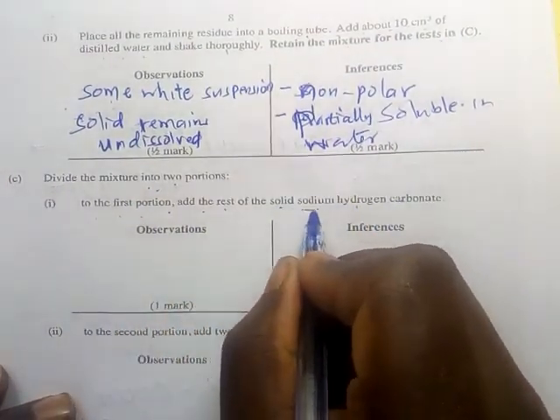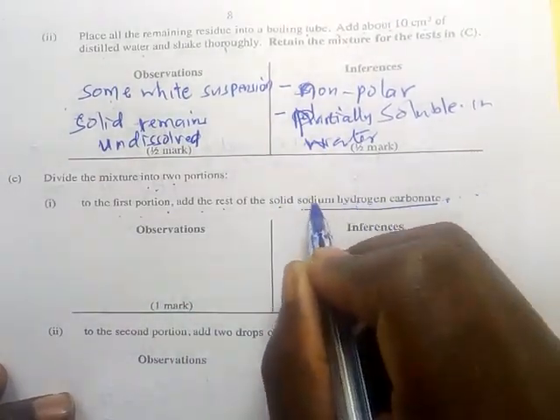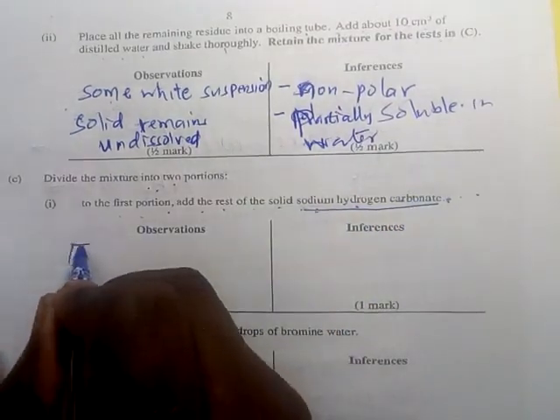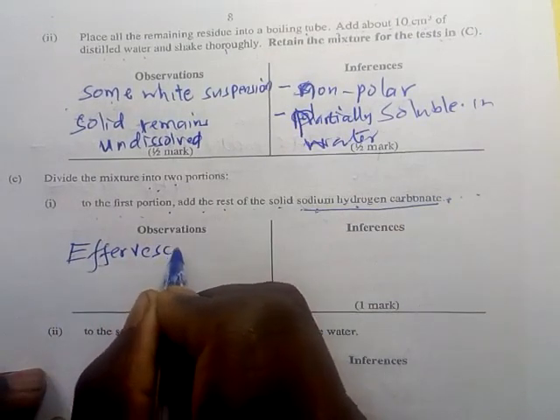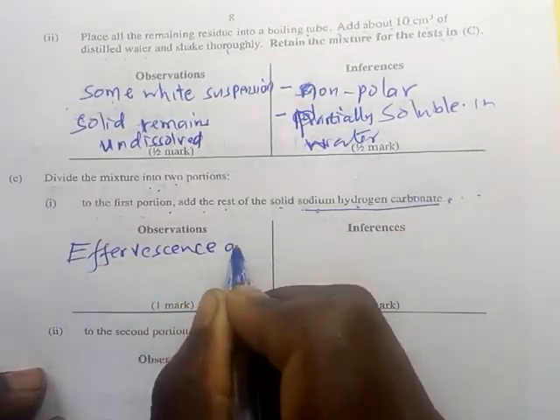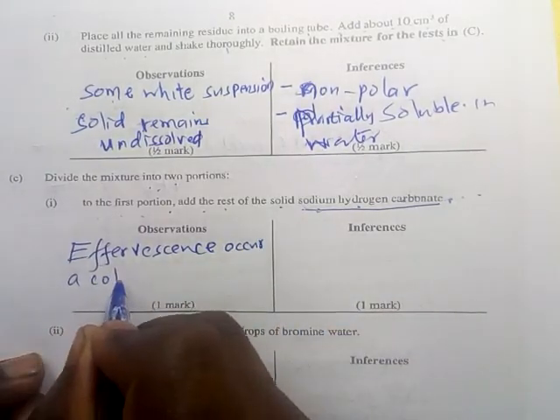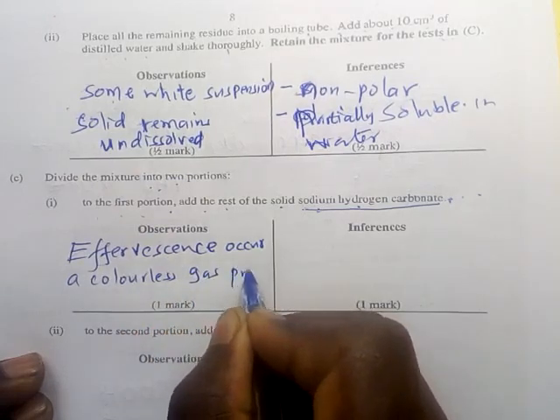So we are adding sodium hydrogen carbonate. Always expect effervescence or no effervescence when you are using sodium hydrogen carbonate. So this time around there is effervescence. Effervescence occurs and a colorless gas is produced.